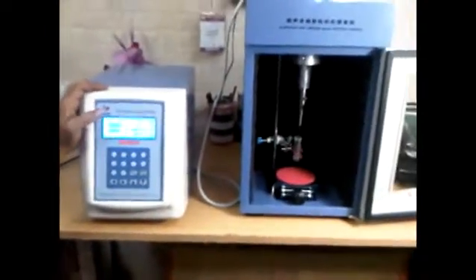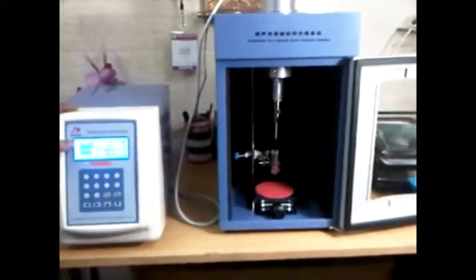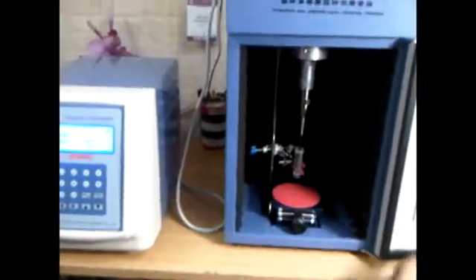This is a brief demo of the machine. We once again thank you for purchasing the Ningbo ultrasonic homogenizer. If you are having any queries, you can contact Uni Genetics Instruments Private Limited, their Indian distributors. Thank you very much.